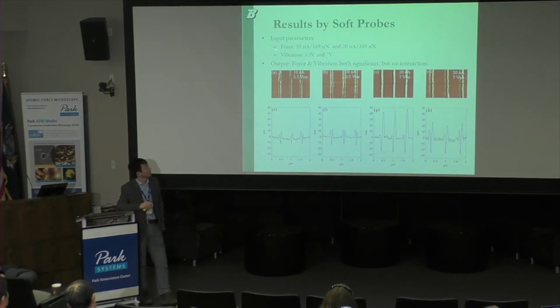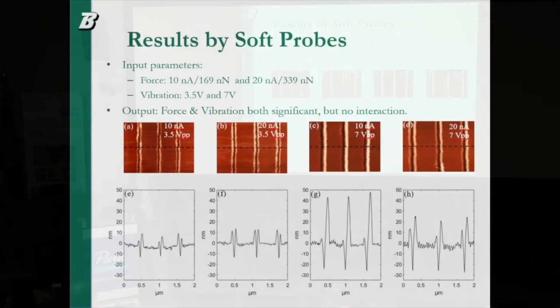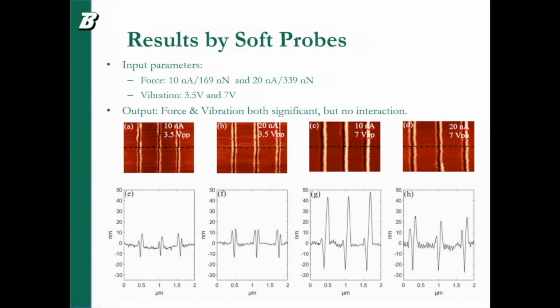As you can see, because we can use very small force, the trenches we can go from a few nanometers all the way to 10 nanometers, and we can go higher if we use a very stiff tip. Nowadays we can apply only 50 nanonewton, so we can create 10 nanometer trenches. I would say it is very hard for other techniques.